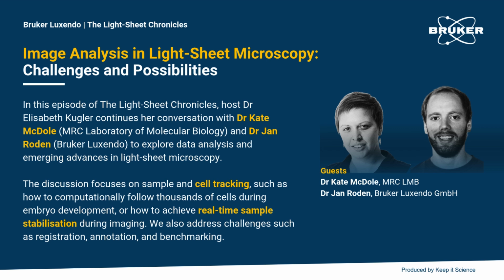Otherwise, you lose more image quality through the inaccurate registration than you gain from the multi-view deconvolution. So in those cases, it's very important to have a fine-grained registration. But if you just want to roughly overlay two channels and see very roughly which place corresponds to which place, then often a rough global affine transform or something like this could be enough.